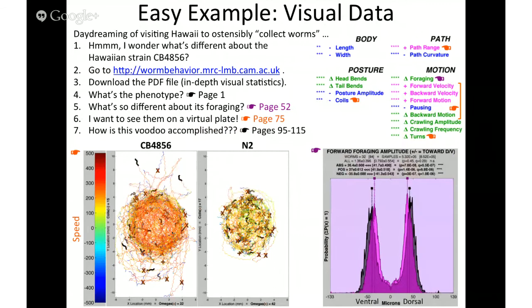So we don't know where the food patch is in the old version of the tracker. I'm rebuilding it now so that you can actually know where the food patch is. This is a trick of knowing where the worm started out roughly and then centering it all, so we get this view on the virtual plate of where the food was likely at. But truth be told, this is just a proxy, and potentially not a very good one. Although it looks like a pretty good one, because the pictures of the food look like that little circle right there. Yeah.